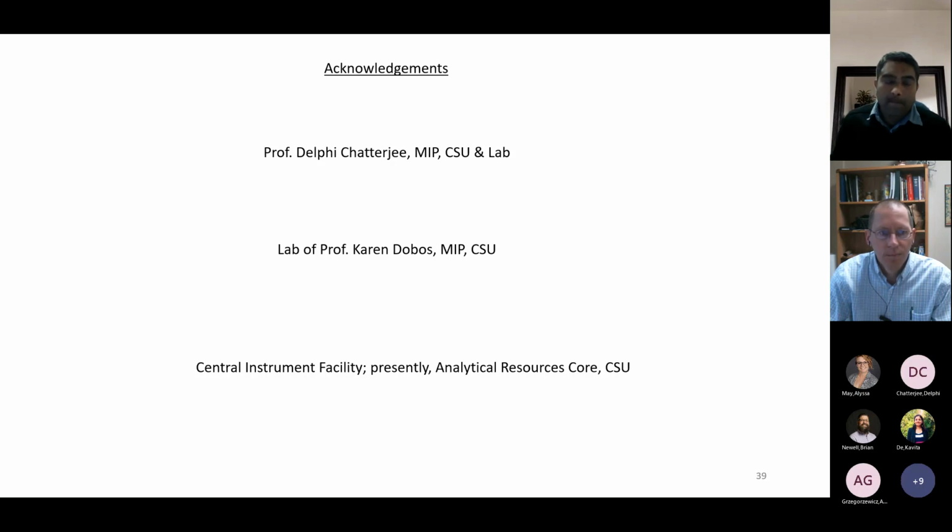I have mentioned Unicarb and Glycomob, which is the ion mobility variation of Unicarb, which are specific for human saliva glycoprotein-related oligosaccharides. Then NIST has developed a database for human milk oligosaccharides. So these are the databases. And then there are de novo software tools like Glycoforest and others.